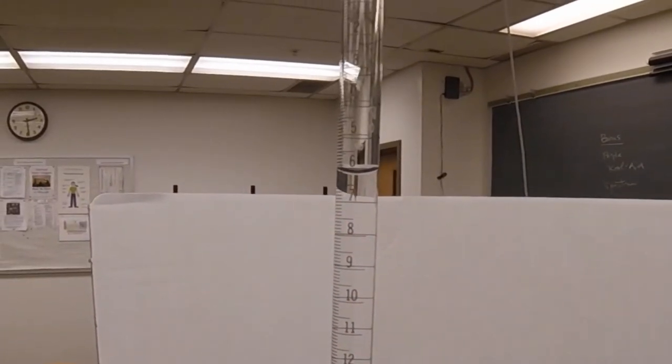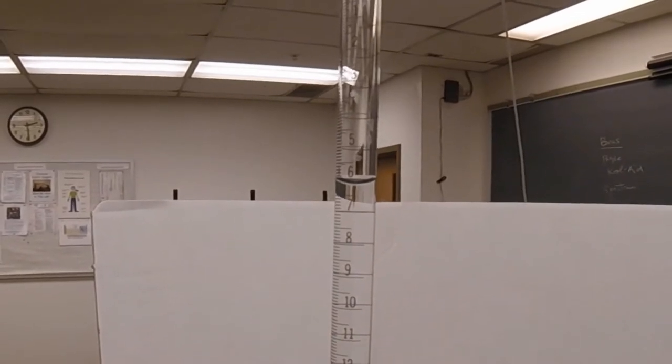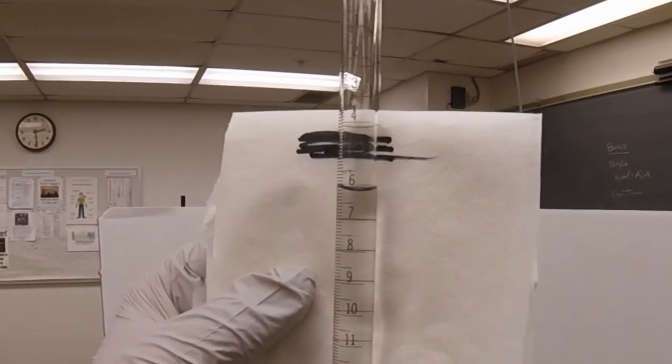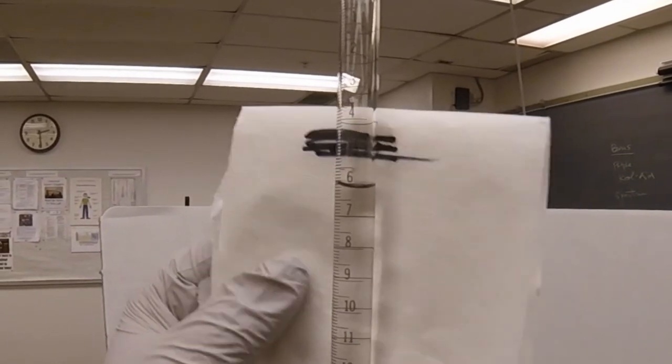When you read this, as you've known, you have to approximate to one extra decimal place. The initial reading for this buret is 6.10.